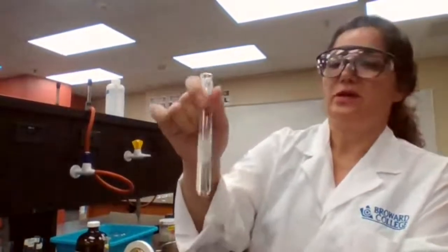Almost there for 0.6 to dissolve. The 0.6 is the concentration of the HCl. The time to dissolve Mg, the magnesium, in the 0.6 concentration.